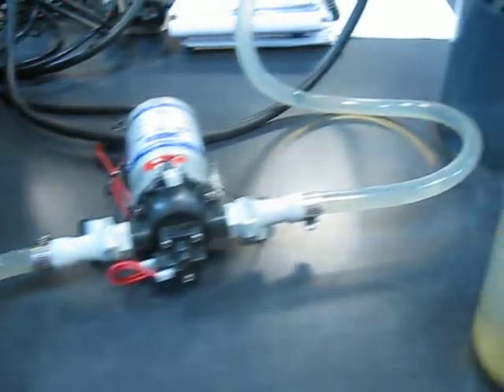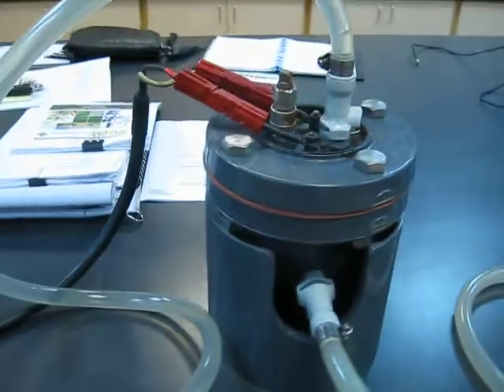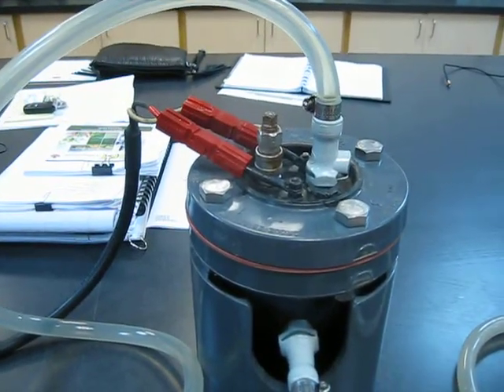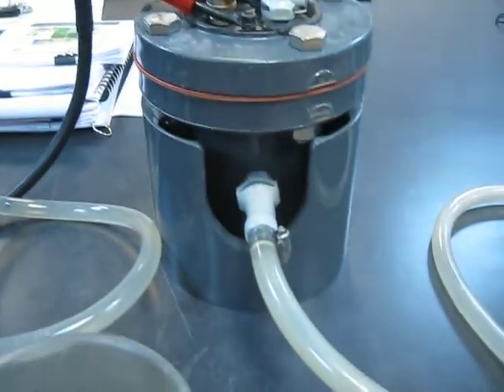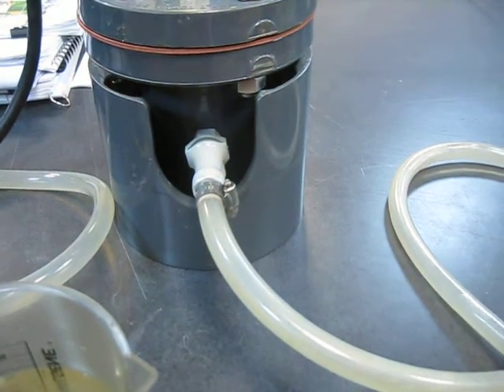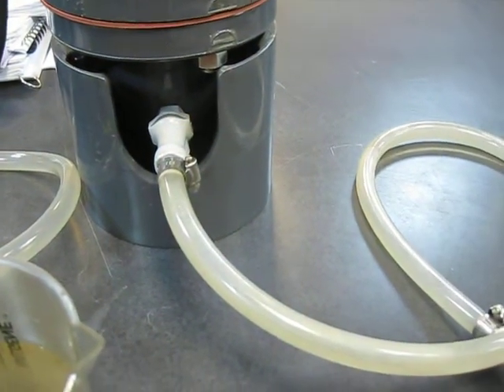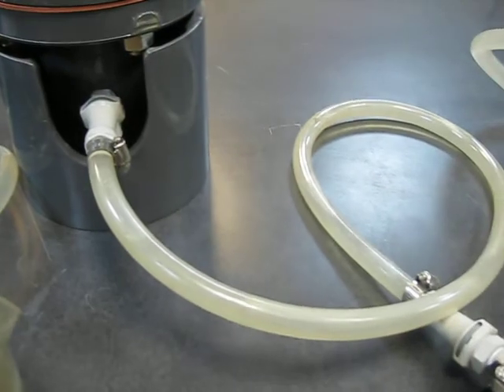So we're pumping up through the pump, in through the top of our electrocoagulation cell, and then out through the bottom. You can see some gas bubbles being formed in the cell, which is a natural result of the electrocoagulation process.